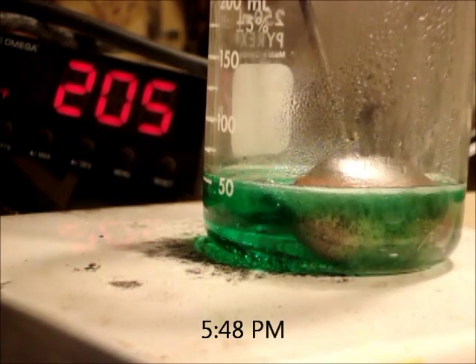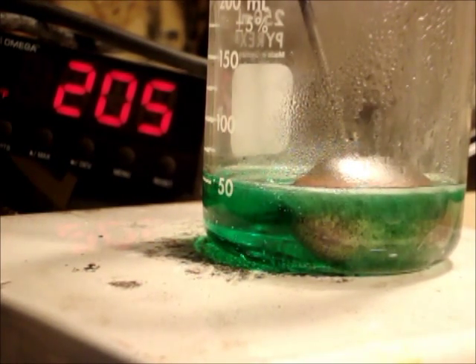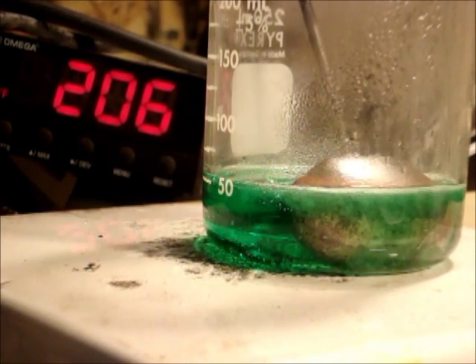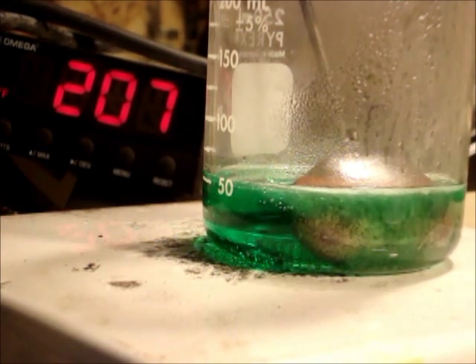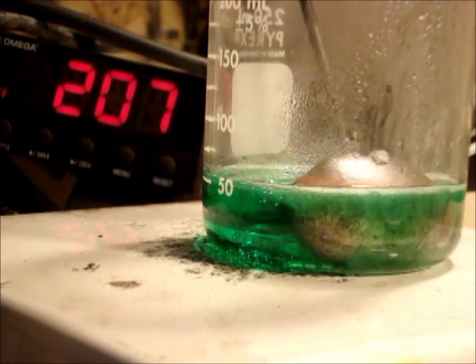Okay, time is 5:48. Still bubbling nicely. The solution is turning nice and green, 205 degrees. And I kick up the temperature a bit here on the rheostat. Setting is about 5.5 now.